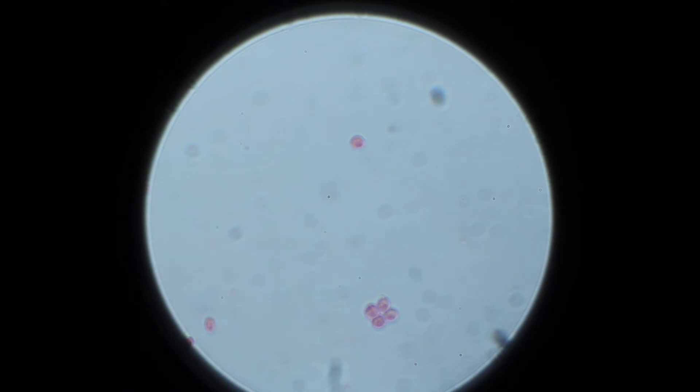Now we're starting to see some diffraction rings around it. So we've gone through the center. Coming down, focusing through it, more towards the bottom. Again, seeing quite a bit of detail.